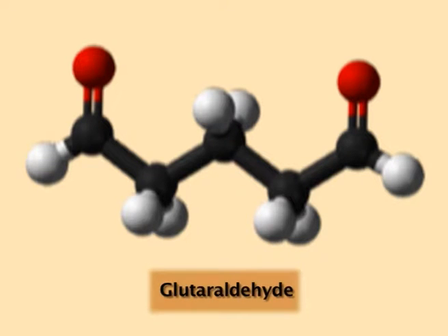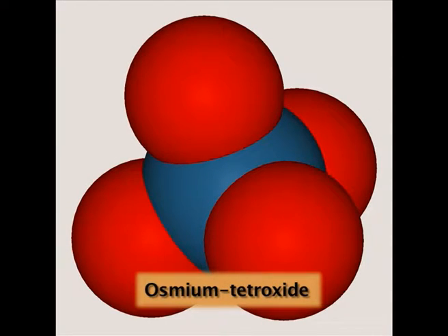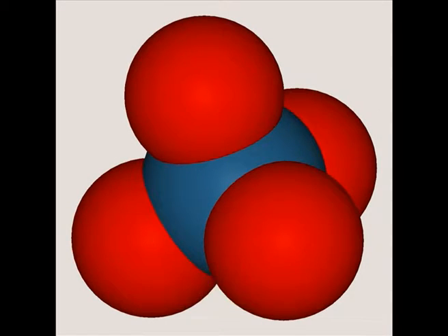As I was discussing, sample preparation for biological specimens is of utmost importance. So first, the sample needs to be fixed. Glutaraldehyde and paraformaldehyde or a mix of these can be used. Even osmium tetroxide is also used as a good fixing agent. Then the sample needs to be dehydrated by grades of alcohol and then embedded in epoxy resin to make a thick hard sample.